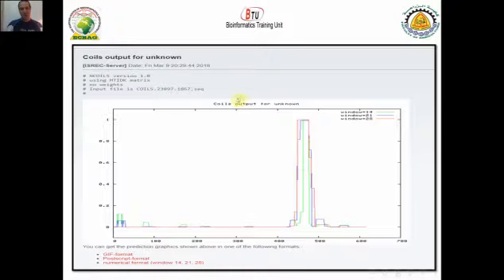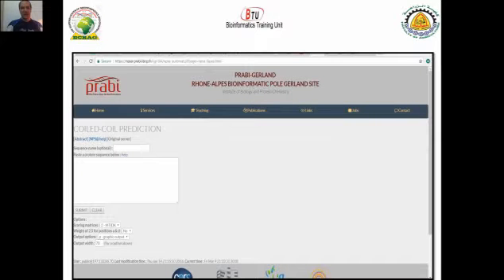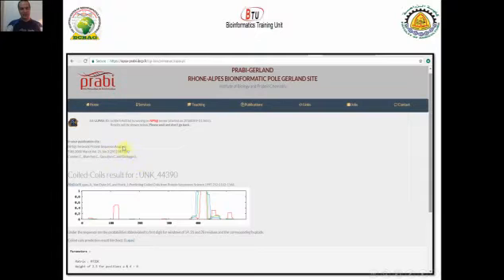There is a threshold that tells you which parts are really significant and which are not. There is another program called Coiled-Coil Prediction, which is another database tool. You can find the link for this program on the ExPASy website as well. You can put your sequence in raw or FASTA format and submit it, and it will give you a similar output predicting which parts of your protein are expected to have a coiled-coil region.